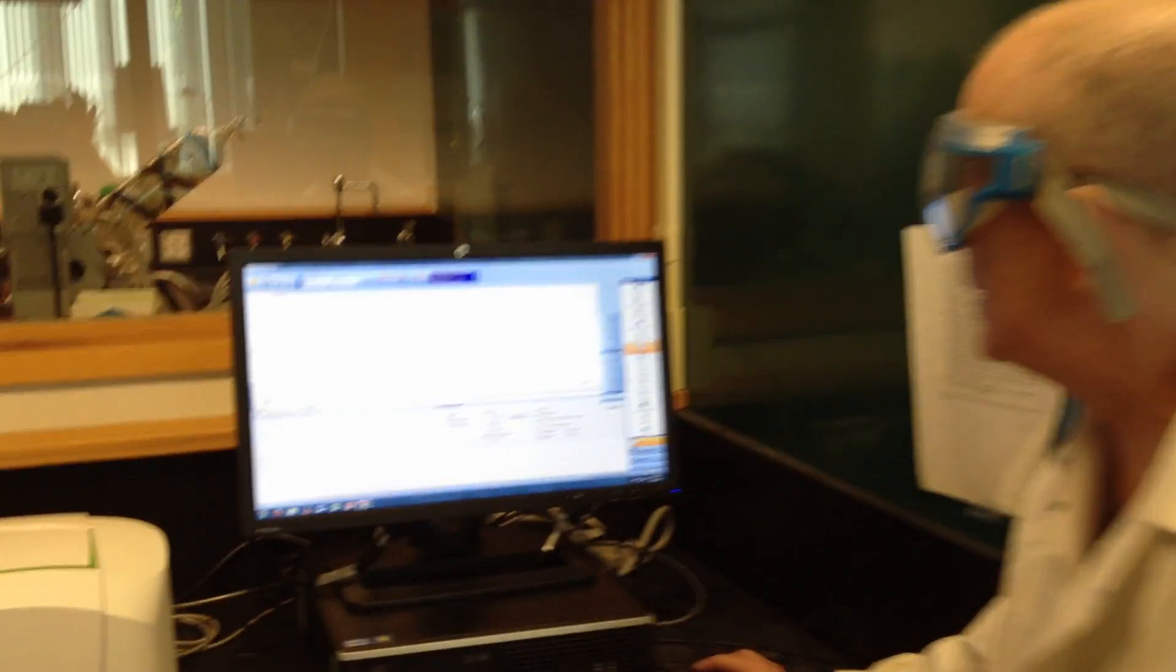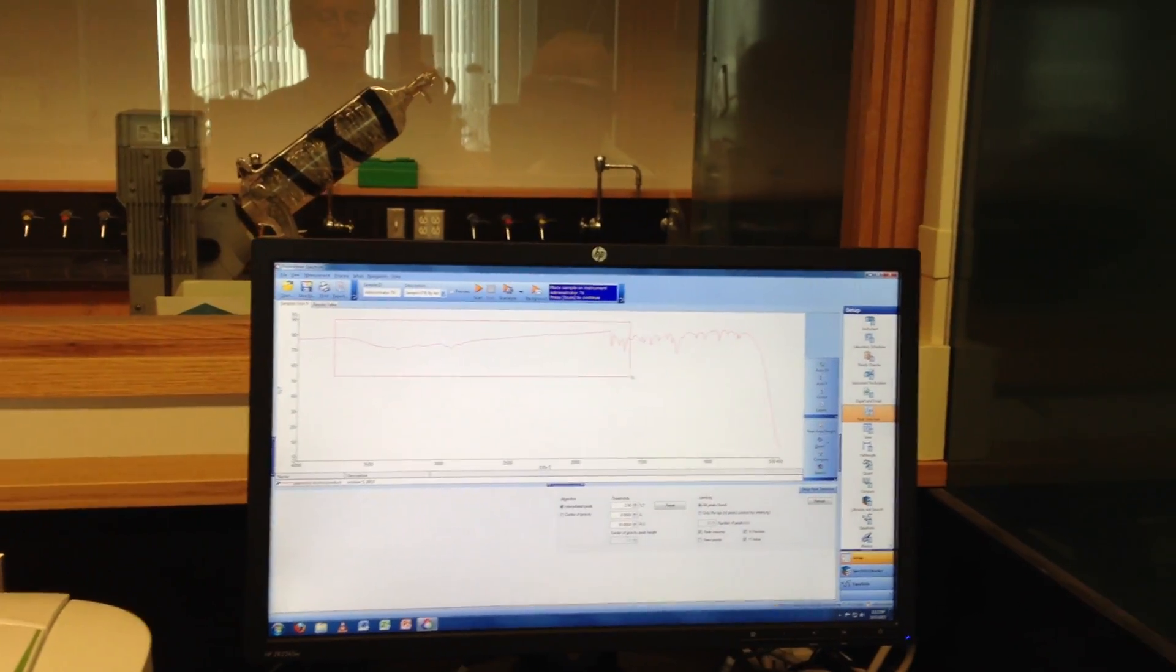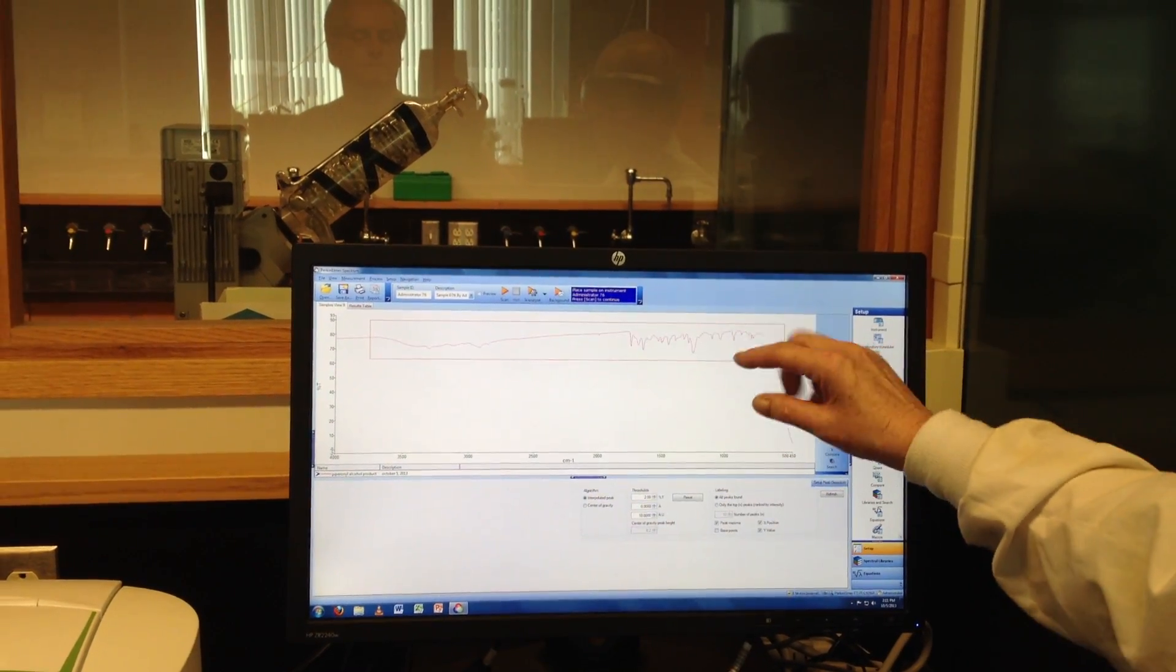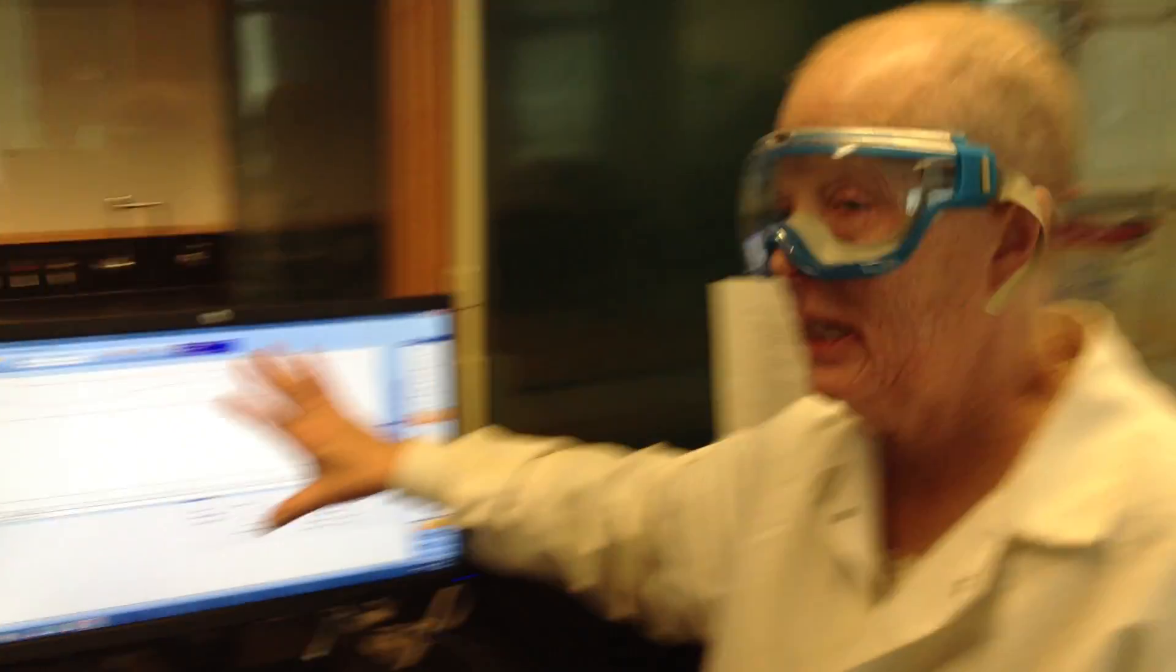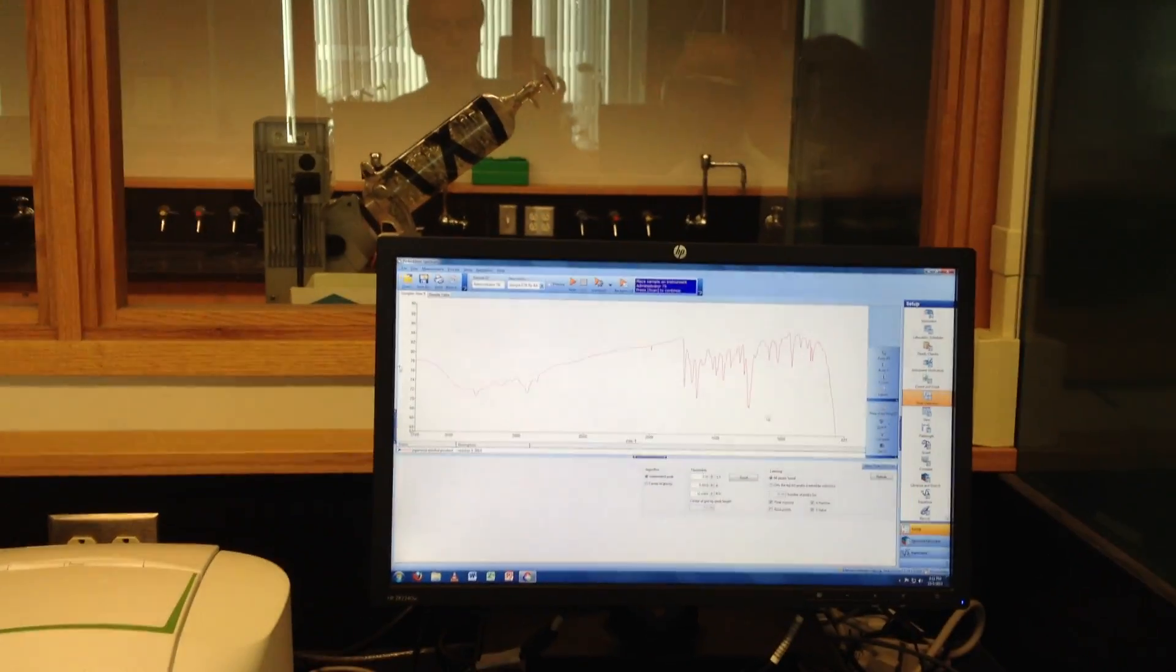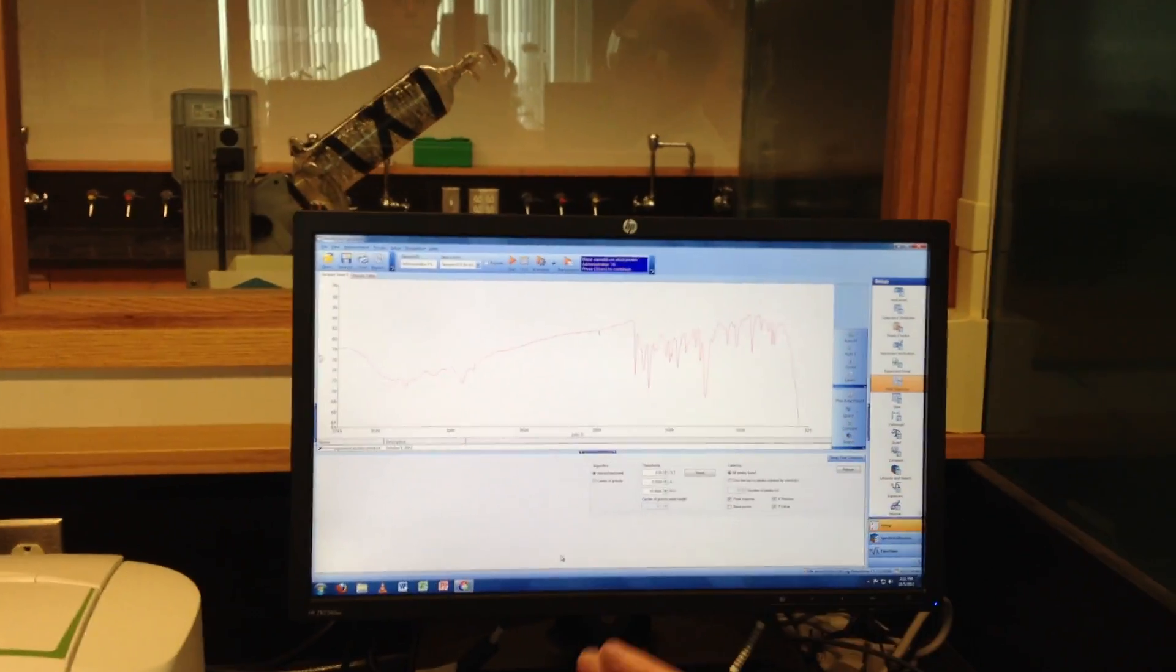What I don't like about this spectrum is it's too small. I can't really see it. So what I want to do is make a box around it. So you just grab this, the mouse, and kind of spread it over. It's really important to make the box very short and wide. Get the entire spectrum in it, but make it short and wide so that you can really expand this out. Then you right-click on the spectrum, and I rescale the graph. So I'm rescaling the graph. You guys are so clever. I am sure you will find 300 different ways you can do what I just did. This is a very friendly interface. A lot of students do it a different way. And I'm like, fine. If it works, it's good. That's how I do it. That's how old me does it. This looks like a nice spectrum for me, because I can see all my functional groups, and I can see my fingerprint region.